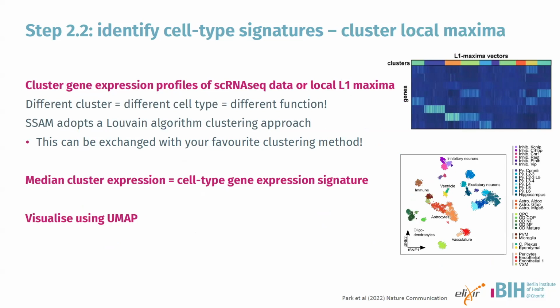We did this in the mouse brain, so actually the correlation between the cell types is quite nice, and we got a very nice t-SNE map. If you don't know what t-SNE is, this is something that preceded UMAPs for low-dimensional representations. And if you know what t-SNE is, then you know how long ago we did this.